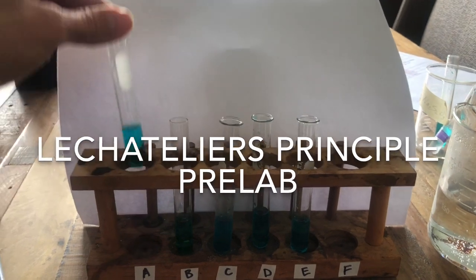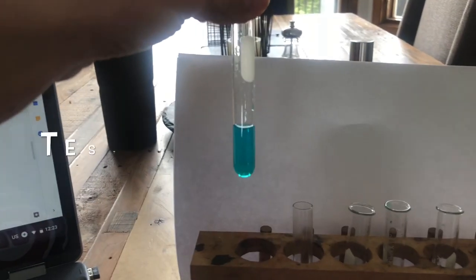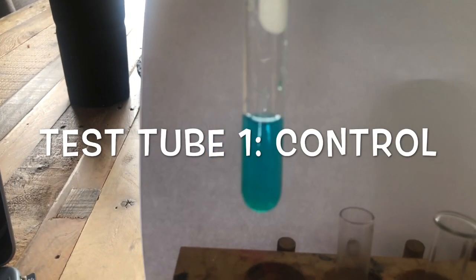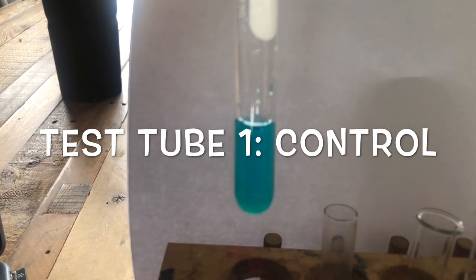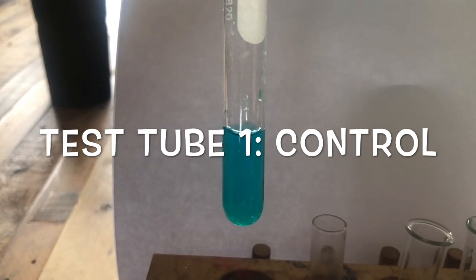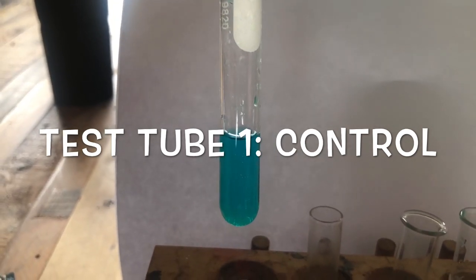The first test tube is the control. So looking at the control, you can see that that's kind of a bluish green color there. So record that. There's no change or stress that we're adding to the control.